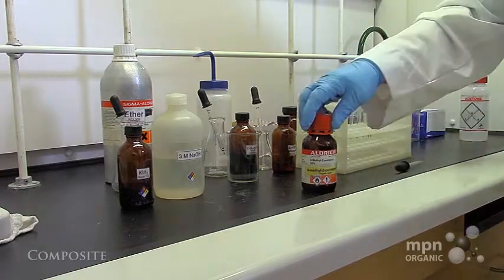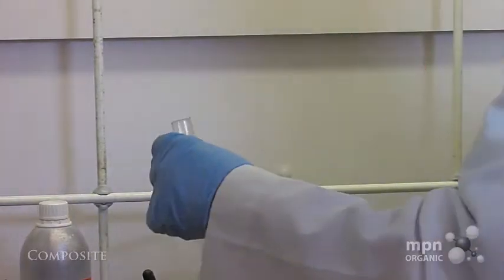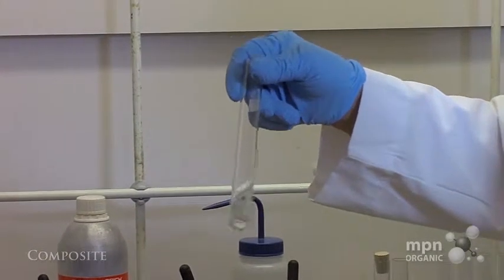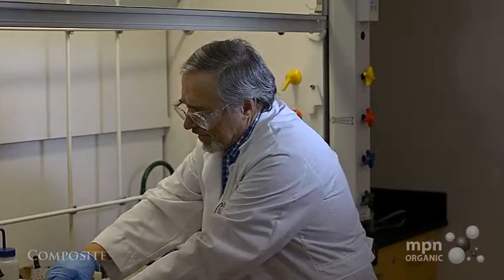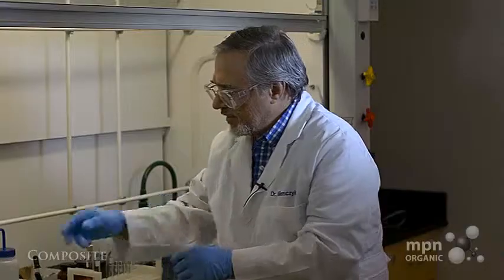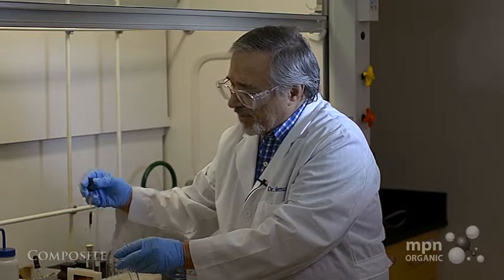Okay, so we've got the 4-methyl-2-pentanol in here. I want to put a bit of acetone in here because, after all, this is the solvent that the oxidation is running in. So I've got acetone as the solvent here. Let's put this down for a minute. Now we're going to be using chromic acid. And remember what I said about chromic acid. It's a Cr+6 compound, so that makes the reagent a very, very dark orange-brown color. The chromium is in a +6 oxidation state, and that's what gives it the color.